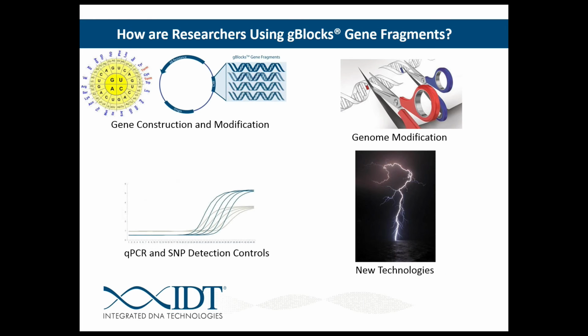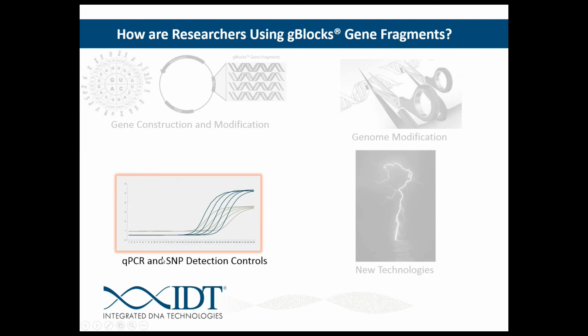Okay, so we've talked about genome modification. I now want to mention a topic that we never thought gBlocks would be used for, or we never envisioned that they would be used for, and that is using them as controls for qPCR and for SNP detection.